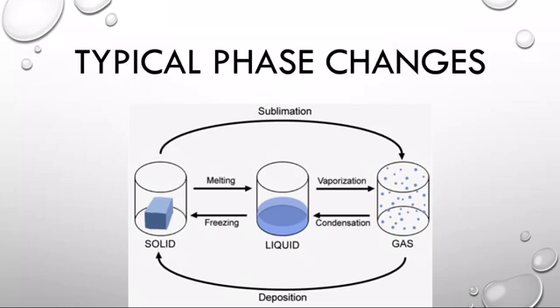Alright, so epic fail number 2. So once we drop the ice cube into the water, our water was supposed to go ahead and freeze all the way through the glass. Maybe it'll work next time. Well, 3 times is a charm, right?